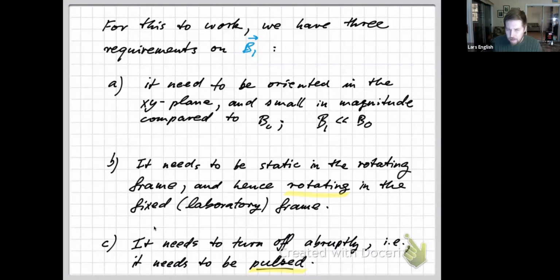Why is that? Well, once the mu has rotated into the xy plane, if we kept B1 on for even longer, then it would keep rotating and approach the minus z-axis. So we need to stop that process. When it's tilted down by 90 degrees, that's when you want to shut off the B1, because if you keep it on longer, then it will overshoot the xy plane and start heading towards the minus z-axis.